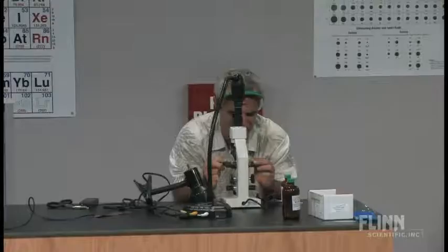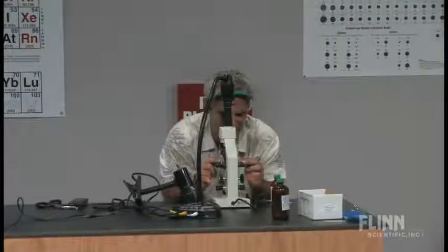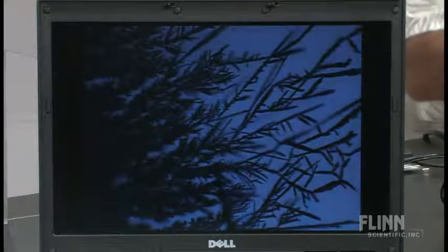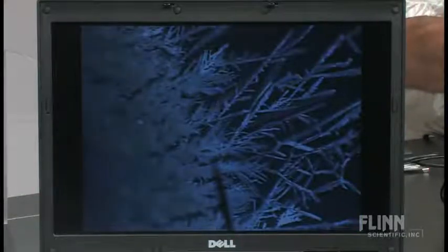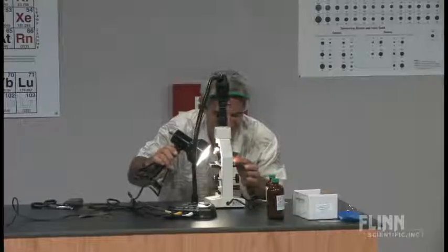This wouldn't show up without the microscope — just a little fuzzy dot. But under high magnification, moving it around, there's a nice little pine branch. They don't look very silvery because they're being lit from behind. If I light them from on top and turn that off, it looks almost like they're snow-covered. Very quick reaction.